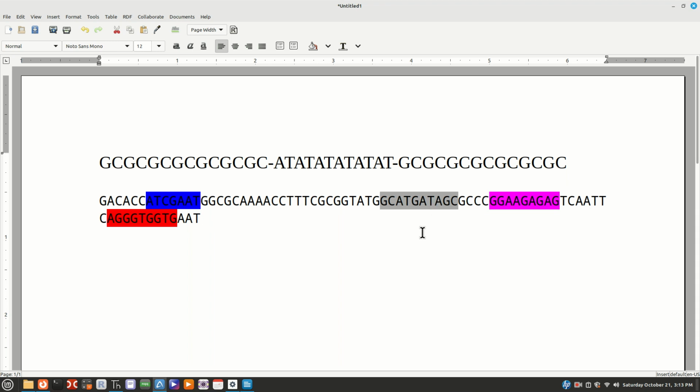So it doesn't quite match our region, but let's see if we go somewhere a little further. We were looking for different ones here. Let's try this one.